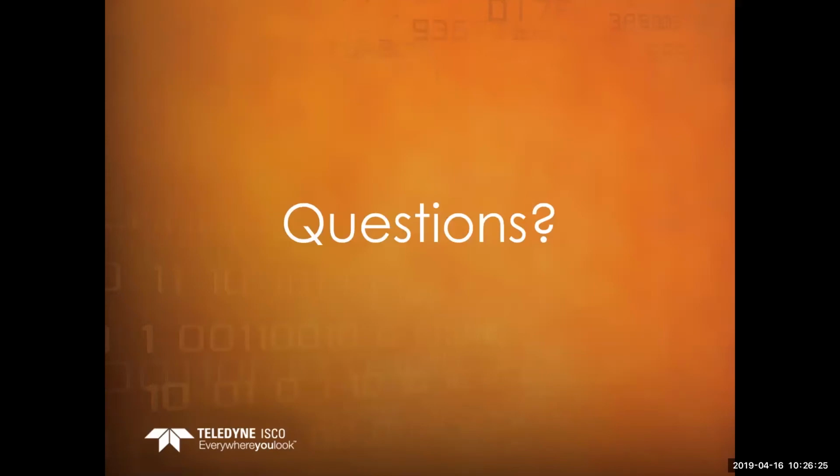Another question that's come in. Can you tell us about interfacing to a PLC or related control system so the system can be automated, or must there be a driver available? This is Dale Clay again. As far as connecting to a PLC, we have a number of options. We have Ethernet, USB, RS-232, RS-485, 0 to 10 volt and 4 to 20 milliamp.